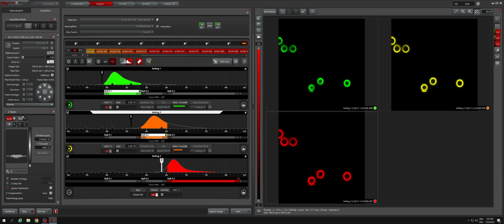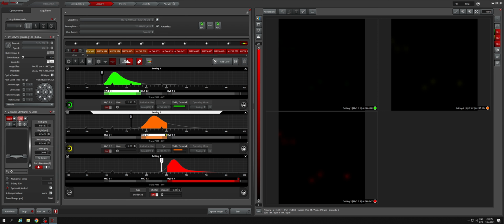And keep going all the way to the bottom. And once you get to the bottom, then all you have to do is click here the end button. There we go. And now you can see here you've got your different values, your actual Z position, the value of your beginning and end. Here's the total stack distance. And the stack is actually here between these 2 points, but it's so close together you can't see anything.